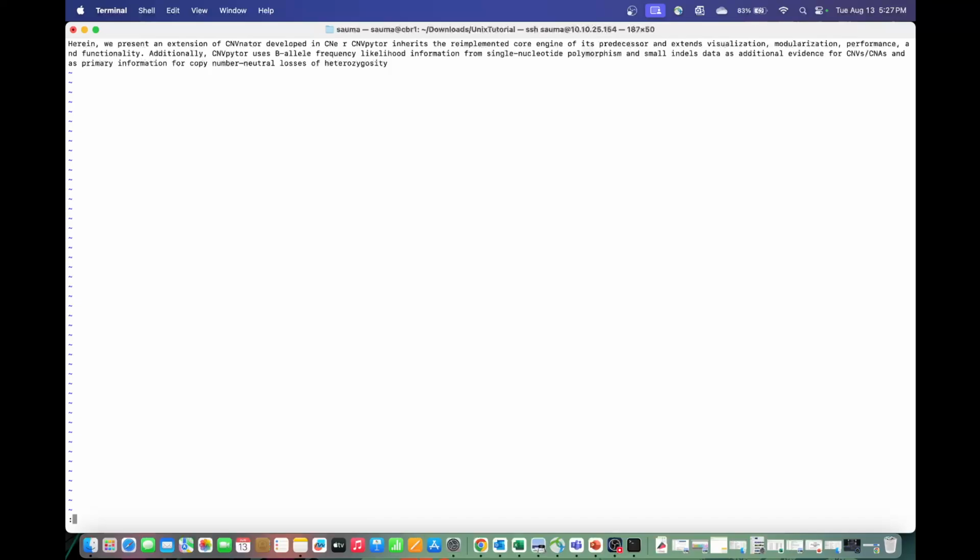So after you have done, you just want to quit. There are no changes you have done in this one. You have already saved the changes the previous time. So you just want to quit this file. Do a colon and a q, and you are out.